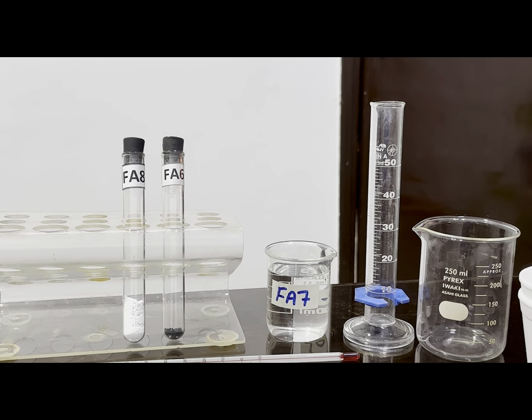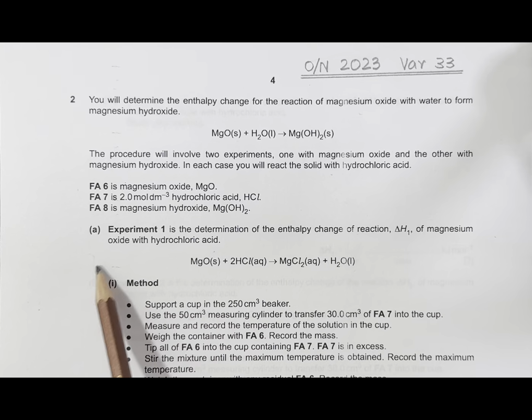Apparatus: a 50 cm³ measuring cylinder, a 250 cm³ beaker, 2 plastic cups and a thermometer. Part A. Experiment 1 is the determination of the enthalpy change of reaction, delta H1, of magnesium oxide with hydrochloric acid as given in the equation.